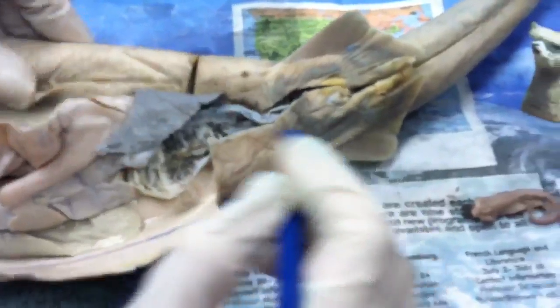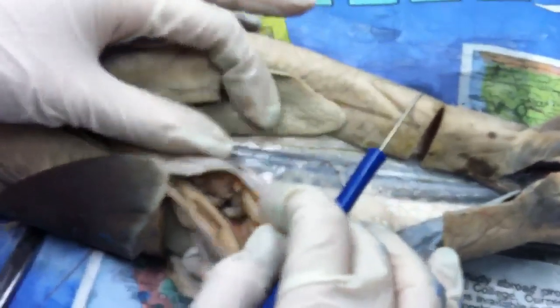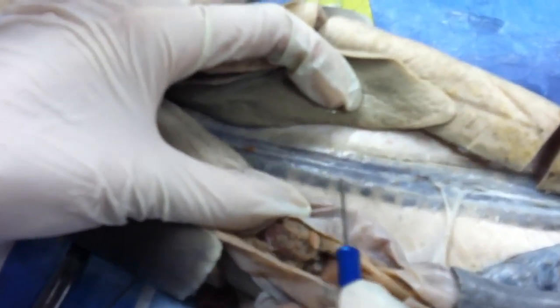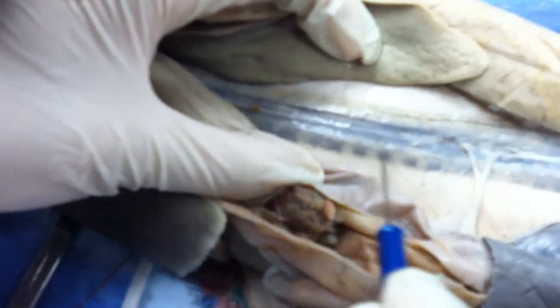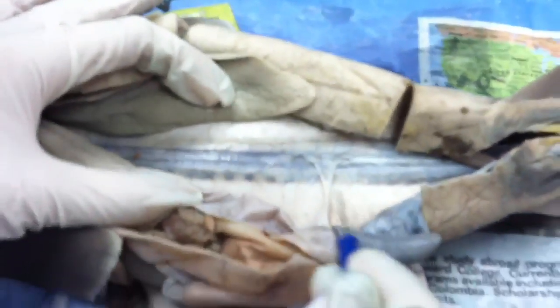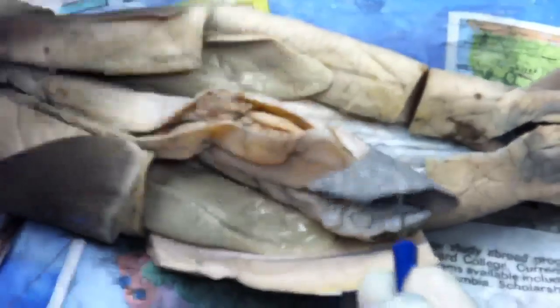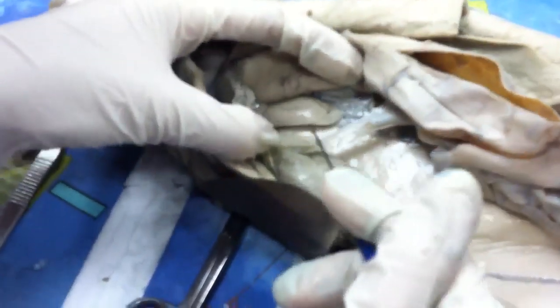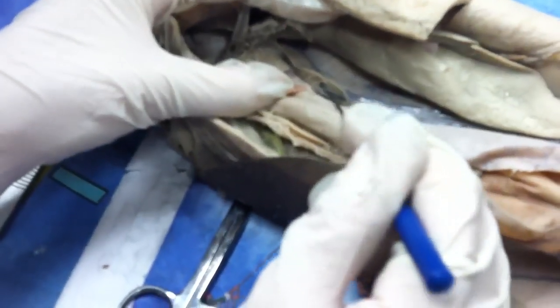Kidney is over here. It's kind of difficult to see, but there's a line down the middle and two lines on the sides — those two lines on the sides are the kidneys. Testes are over here, which is unique because they're by the shoulder almost. One testis on one side and another testis on the other side — just like normal males, two testes.